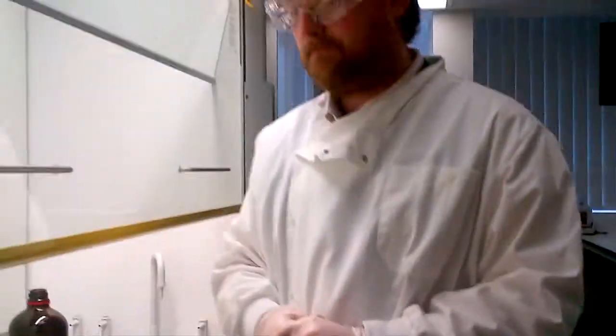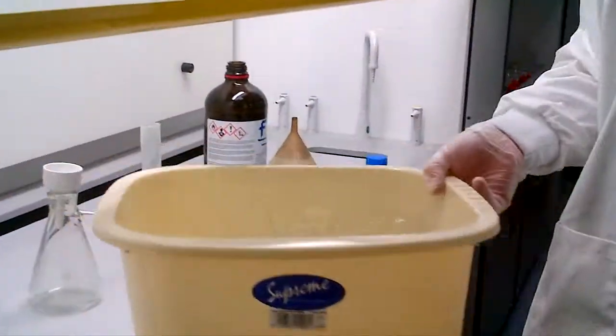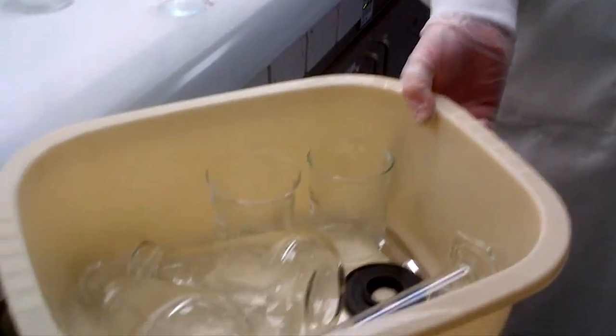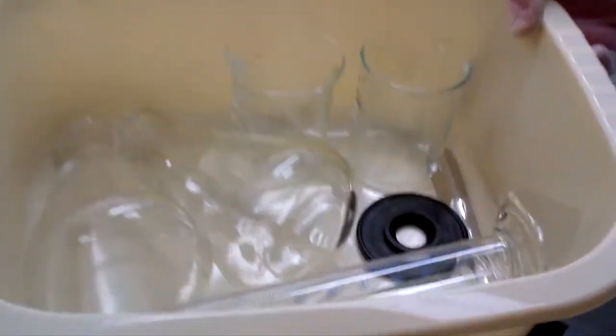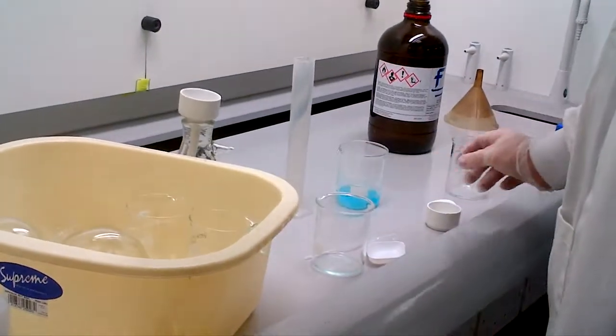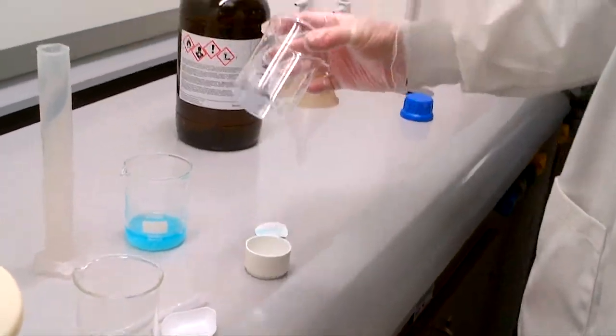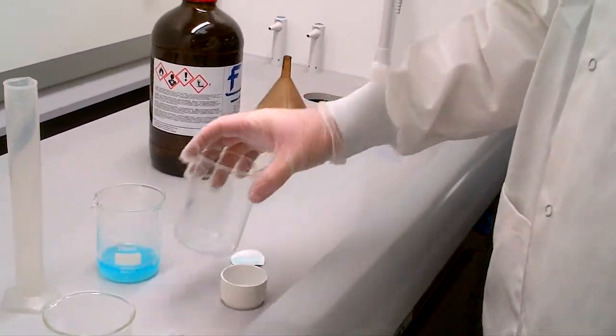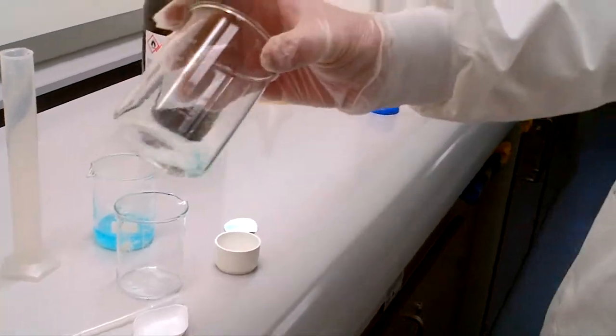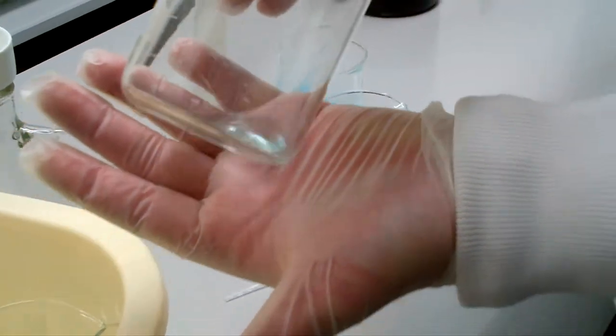Now, you've done your practical, you've got a manner of glassware, what do we want you to do? Well, we ask you to take receptacles, bowls with you, to your fume cupboard area. Once you've done with your glassware during the course of the practical, put it in the bowl, collect it together, and then you're going to wash at once. What have we got here? Let's say, for example, we have some organic waste.